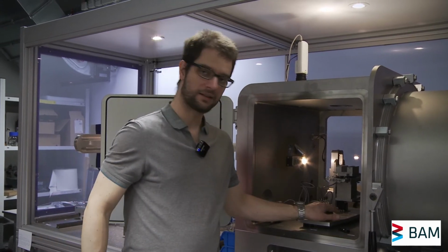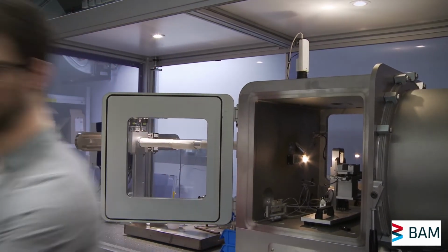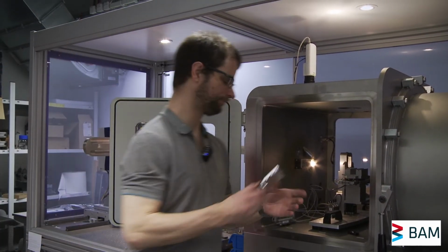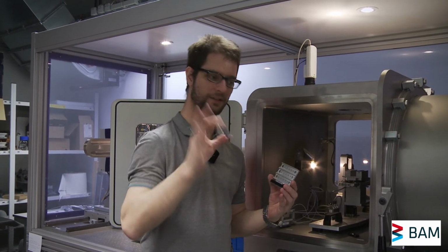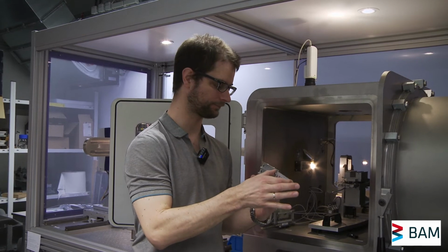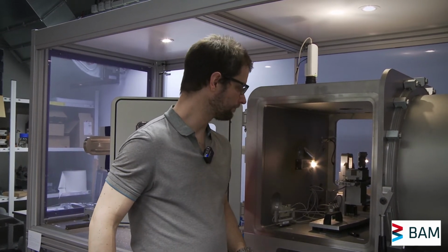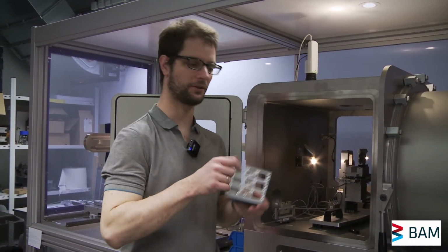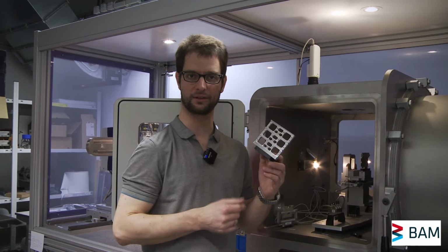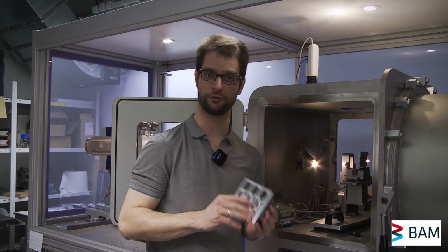All right, our standard XY stage is where we put most of our samples on. For this, we have our standard sample holders. This can hold 3 slides with up to 5 samples each, and this can then be put on the foot of that sample stage. As I said, we're upgrading this. We're going to put a larger XY stage on with sample plates that can hold up to 48 samples for an entire rack. So that will keep the instrument busy for a good 2 weeks.